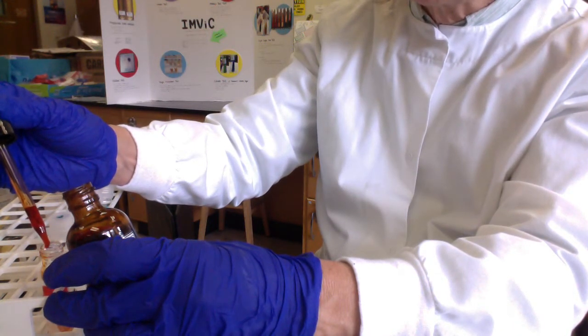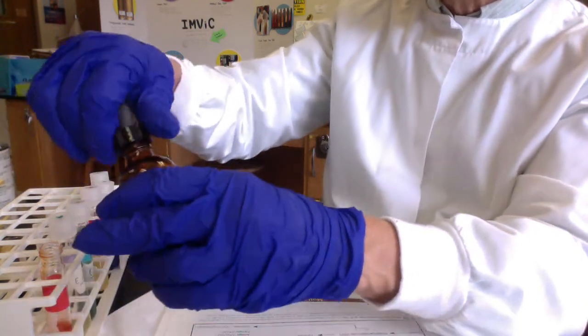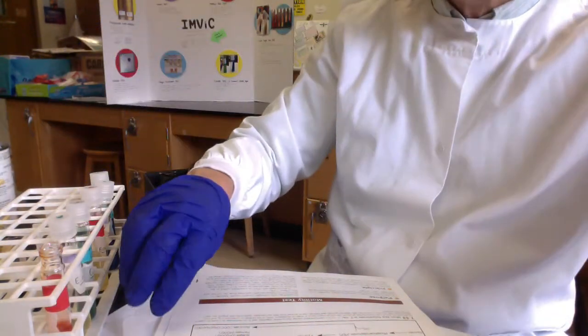So I'm just adding a few drops of the methyl red pH indicator, and I'm going to shake it gently.